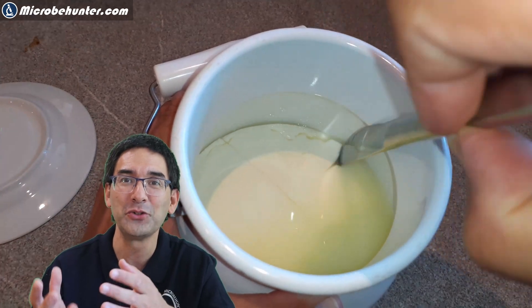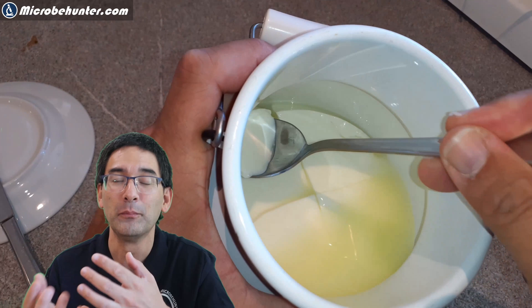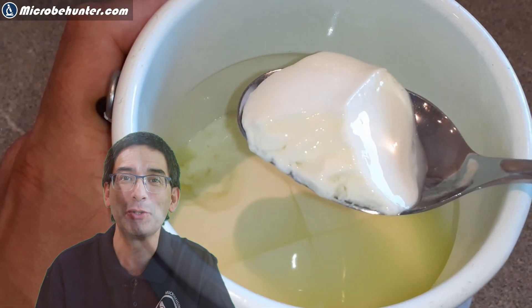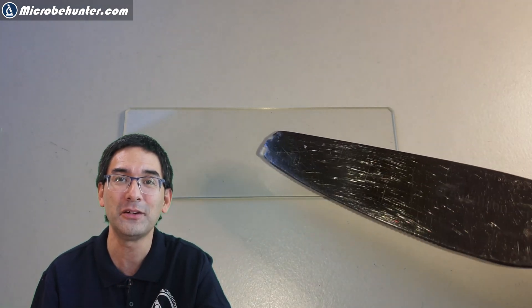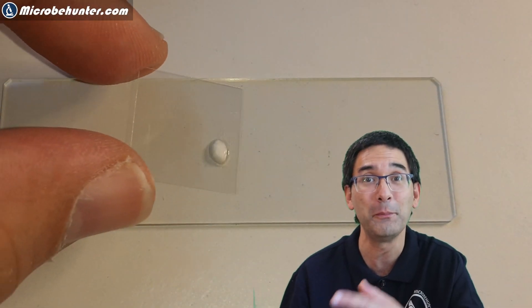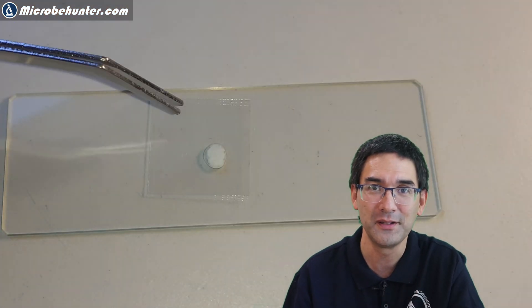By cutting it you also allow some more of the liquid to escape. I personally like yogurt to be more solid. Of course, this is not a cooking show but a microscopy show. So I'm going to not only eat the yogurt but also put it under the microscope to see a comparison of how the bacteria that come from the yogurt actually look under the microscope compared to the ones in the freeze-dried sample. It's pretty simple — you just take a little bit of yogurt and compress it between the cover glass and the microscope slide.